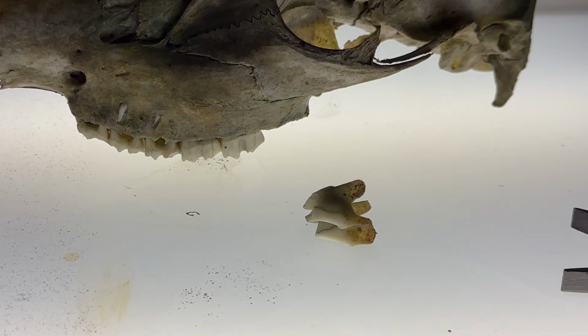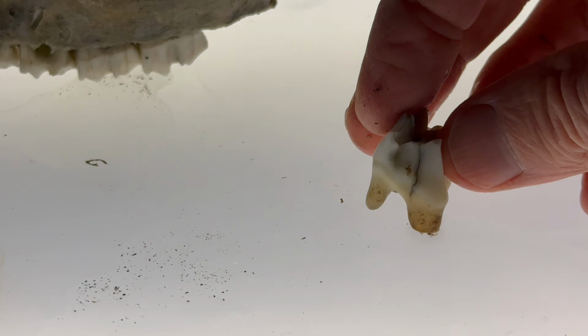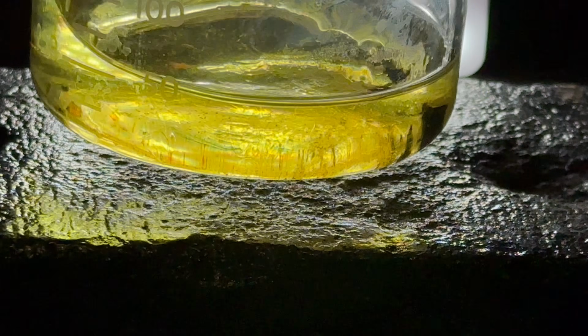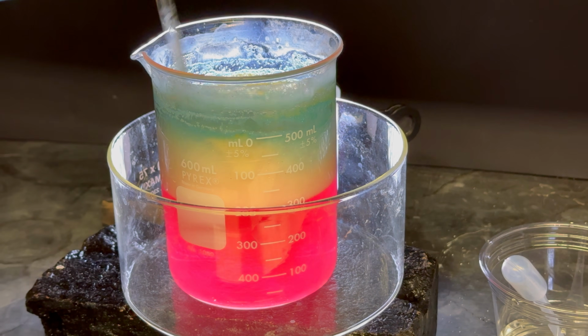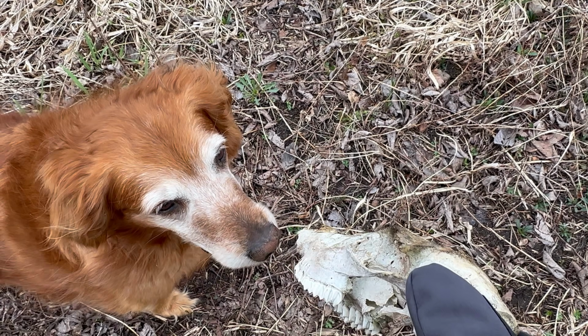The obvious answer is that teeth aren't 100% hydroxyapatite. They contain other material, like tough collagen protein, and this crazy undissolved brown-black stuff. Anyway, I gotta say it was pretty satisfying to estimate for myself how much calcium's in a tooth, but not nearly as satisfying as the chemical transformations I saw along the way. I need to take Ruby for some more walks.